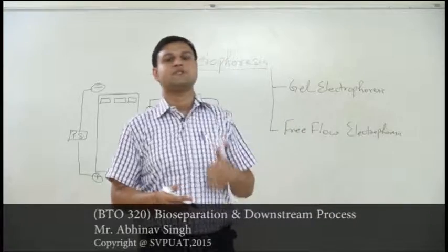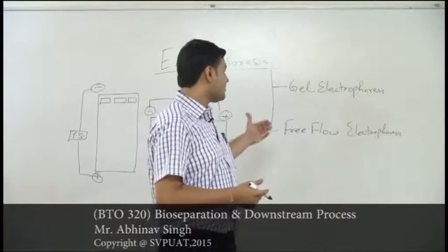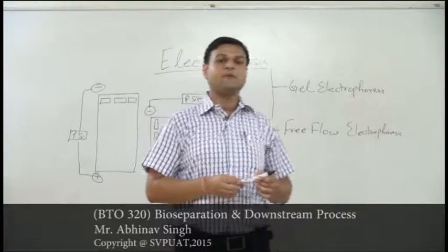So there are two kinds of electrophoretic techniques: gel electrophoresis, and the other one is free flow electrophoresis, which is also called liquid electrophoresis. Clear? So what is to be done in free flow electrophoresis?